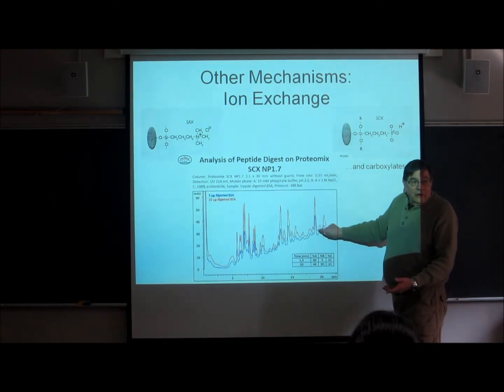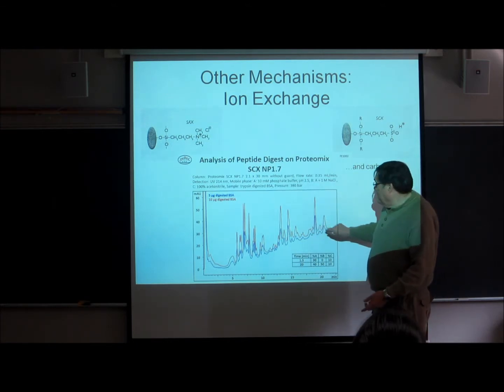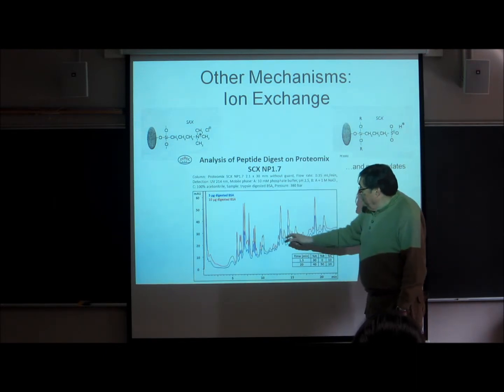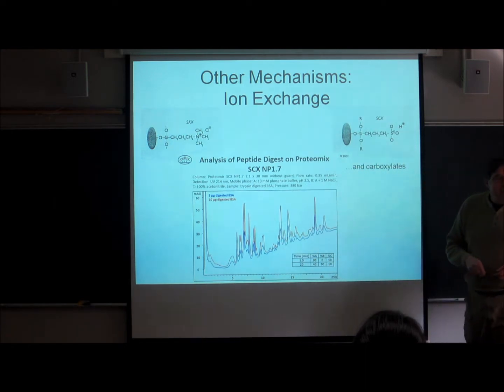They're oligopeptides or smaller things. Probably dipeptides on the smaller side here. Oligos up in here. Okay, so this would be of use, I suppose, if you're studying metabolism.